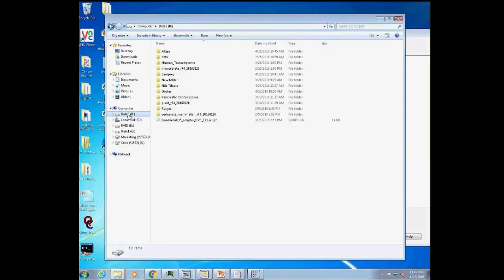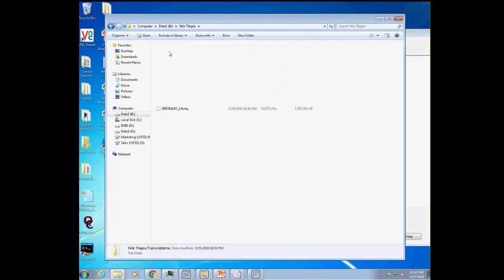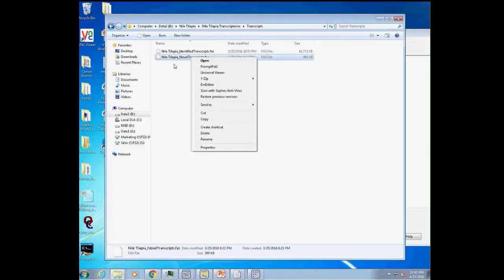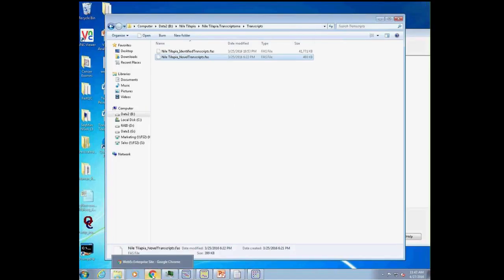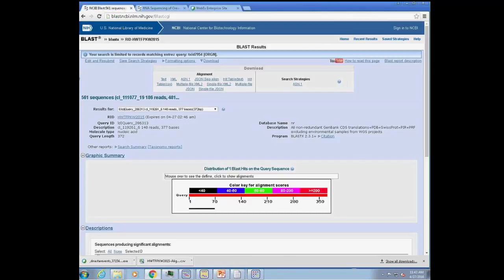I'll just show you how I had done this, and there are better ways to do this. I went back to my de novo transcriptome and into the transcripts. It's this novel transcripts file, these 561. I can sometimes just copy that or open it and copy it and do a BLASTX. So here's the 561. I went to NCBI and loaded the sequences in and did a BLASTX.